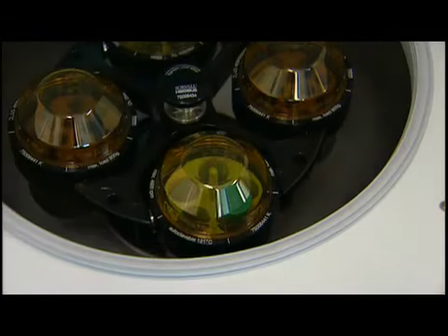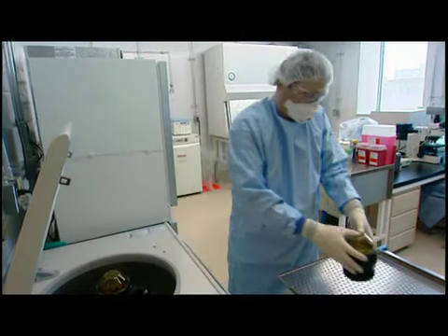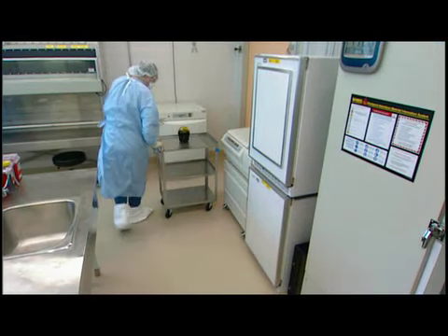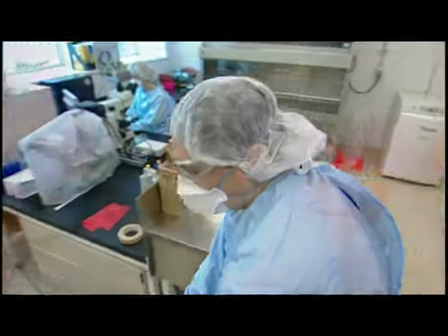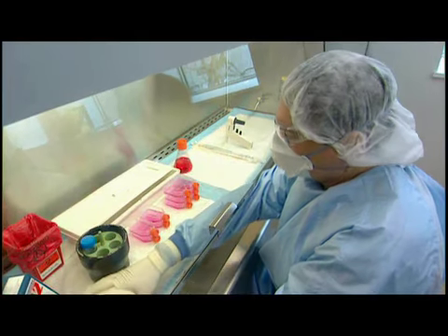Biological materials handled outside the BSC must be contained at all times. And when you are moving material between the centrifuge, BSC, benchtops, incubators, and refrigerators, always use a trolley or a cart and make sure you've decontaminated any material before removing it from the BSC.